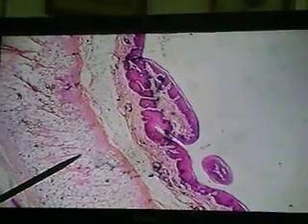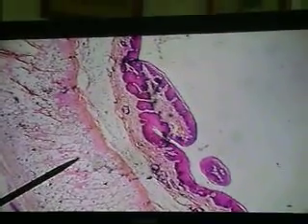Alright, let's move on. Let me look at this epiglottis now. Now, you see I got some gross anatomy for them. Bronchial tree right here. Excellent. So there we are now looking at a slide of the epiglottis.